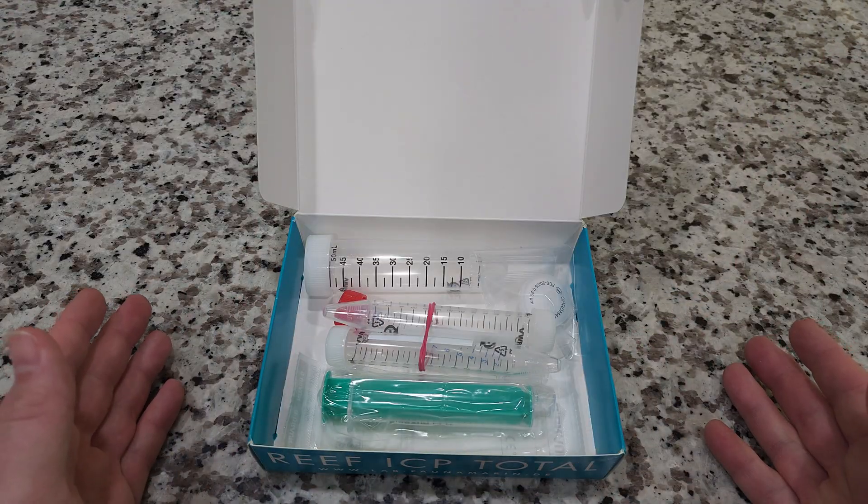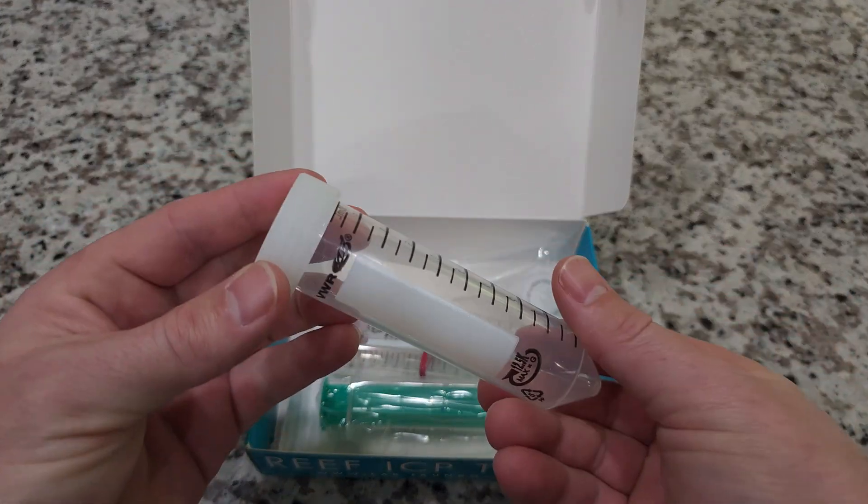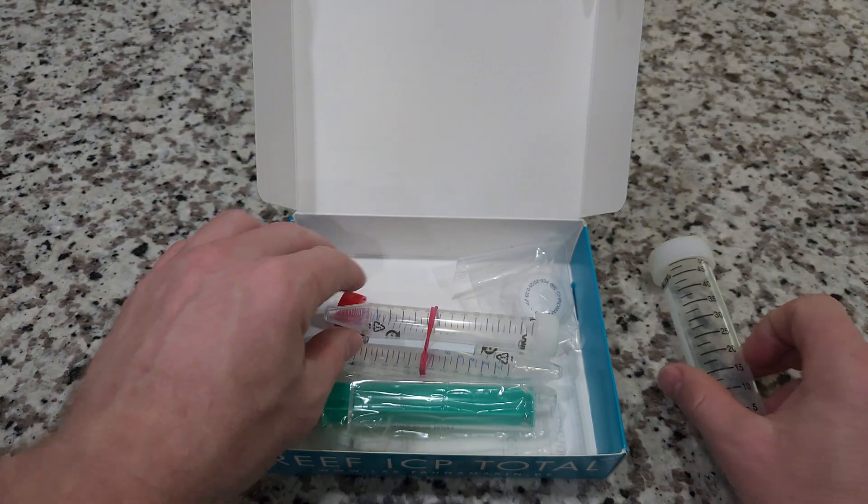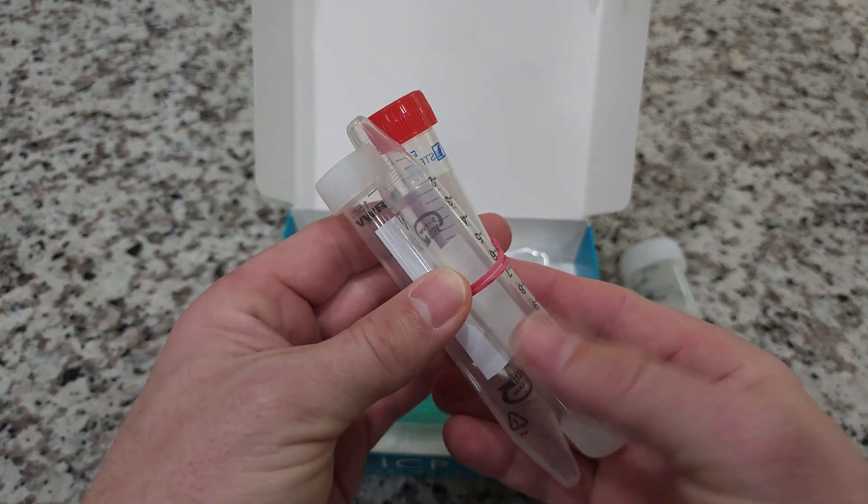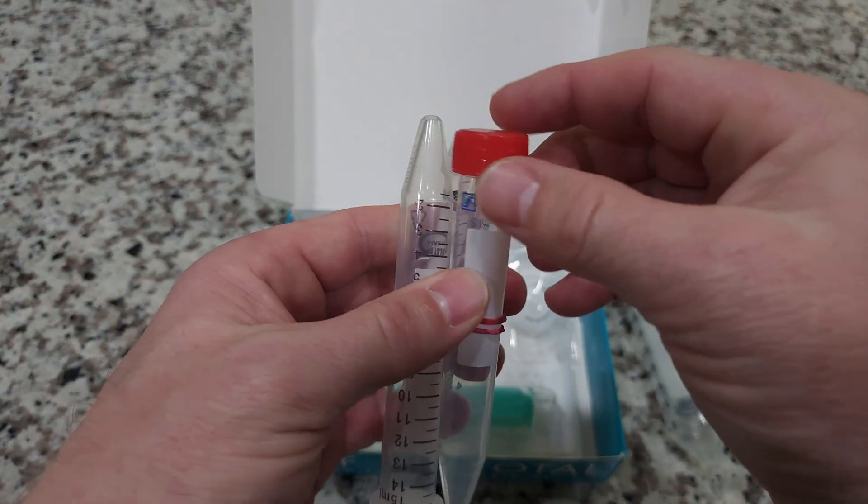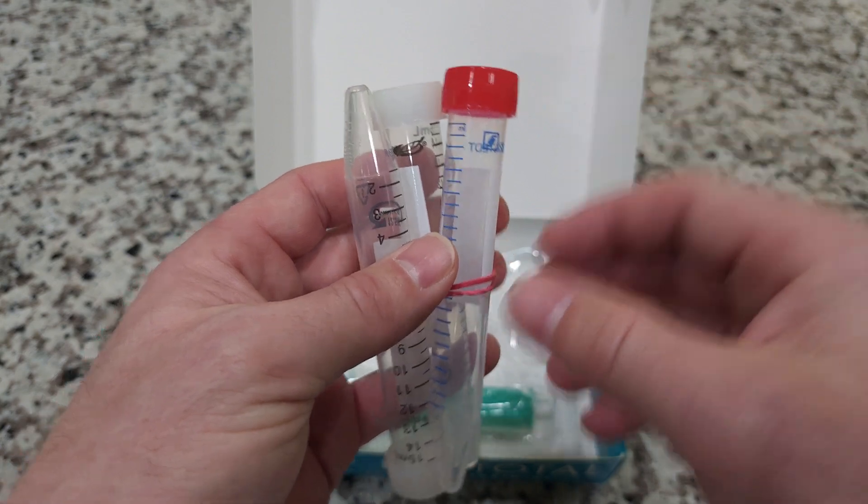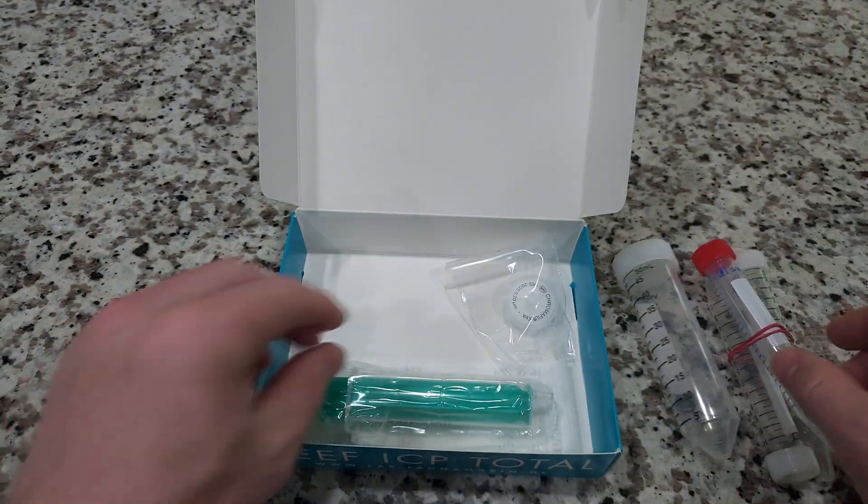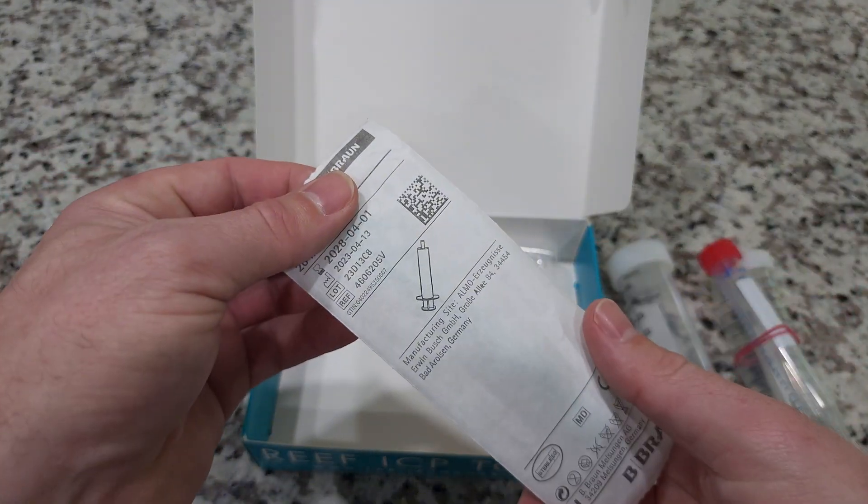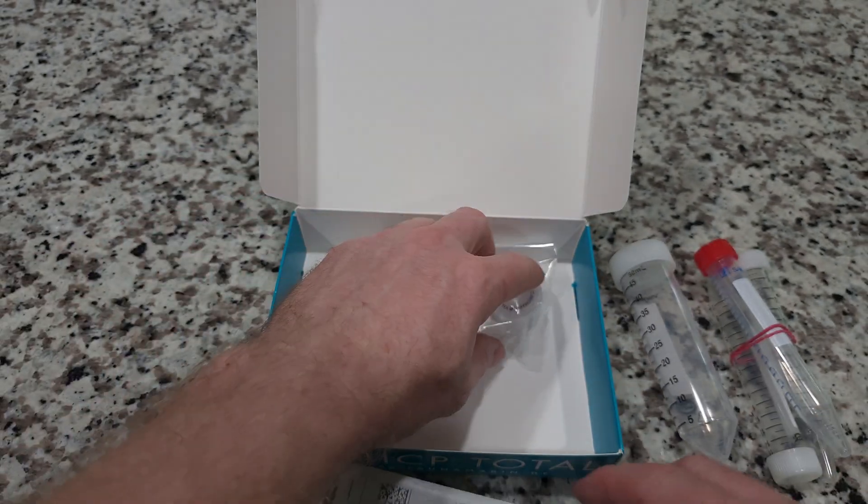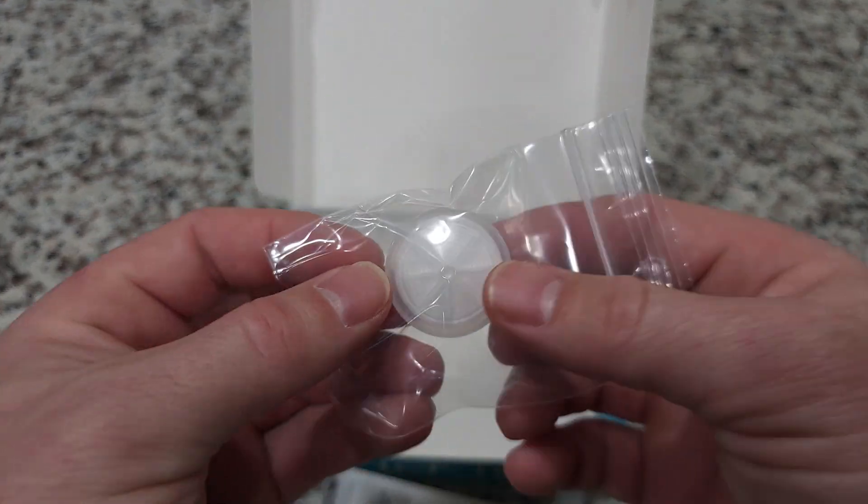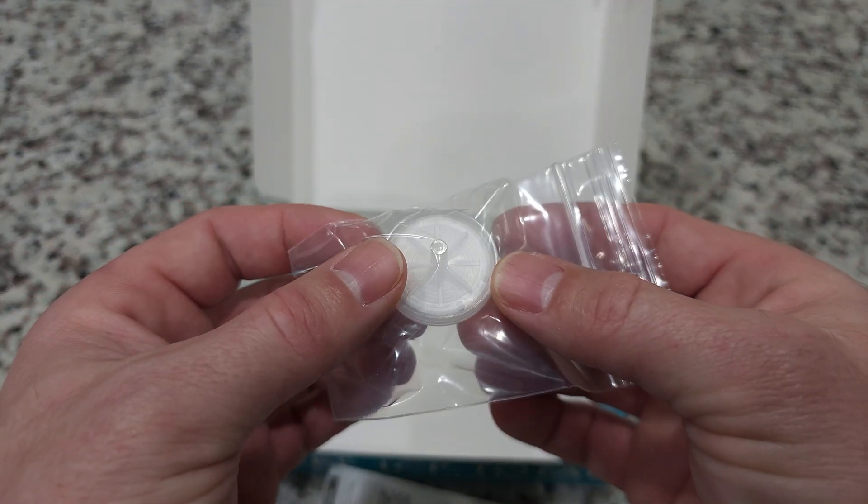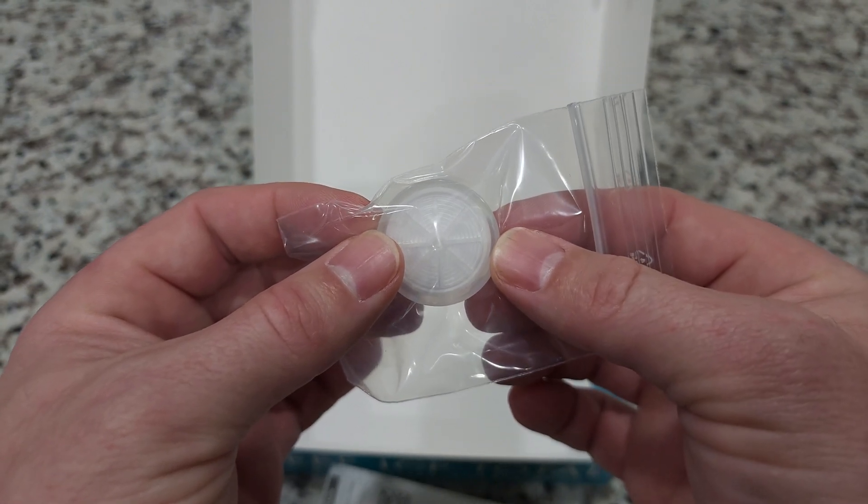Here's what you're going to get in the box. You have this big vial right here and you have three smaller ones. The one with the red lid is so you can test your RODI water, which is absolutely amazing. You're going to get this syringe right here which holds 20 milliliters and you're going to get this little filter. This is a bacterial filter and I'll show you what to do with this in just a minute.